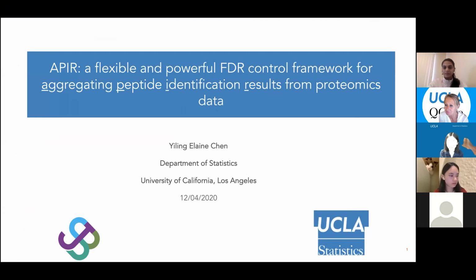I'm going to introduce my graduate work, which is called APIR, a flexible and powerful FDR control framework for aggregating peptide identification results from proteomics data.